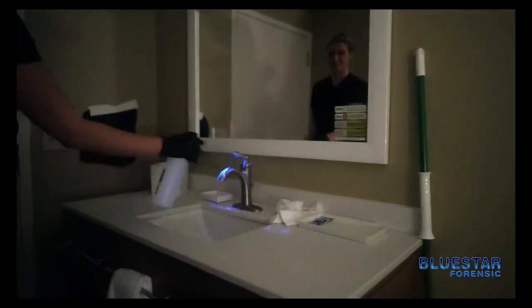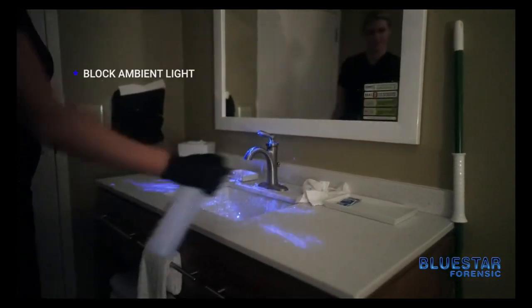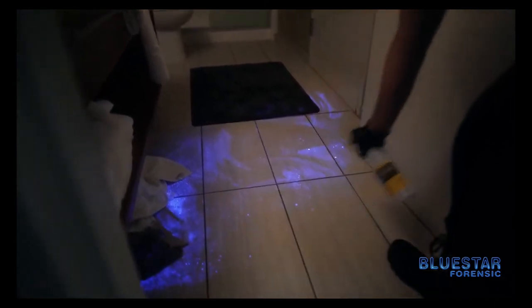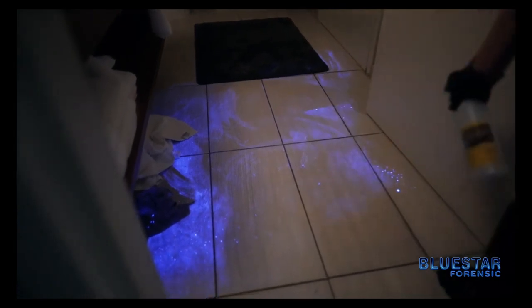Additionally, when you're trying to photograph, you want to block any unnecessary ambient light that could impede your photograph. When you're using Blue Star, remember everything you're documenting at this point is evidence, so you want to make sure that you do this properly.